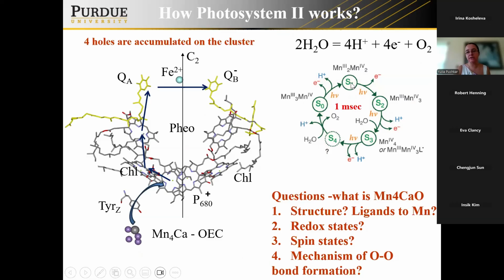So the catalytic cycle is very complex. Here you see the dark stable state where everything starts. It has manganese 3 plus, manganese 4 plus ions. And you can luckily clock it with laser pulses: you can give 1 laser flash, 2 laser flashes, and then after the 3rd laser flash, some kind of transient process happens, and the clock time is 1 millisecond.